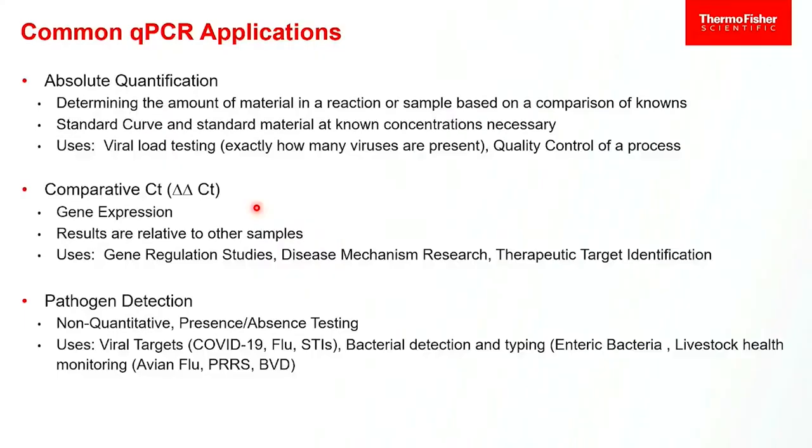Chris and I have been having a conversation recently about looking for environmental DNA and how much of that do I have. But you have to know if you have it before you move forward, and that would be detection.